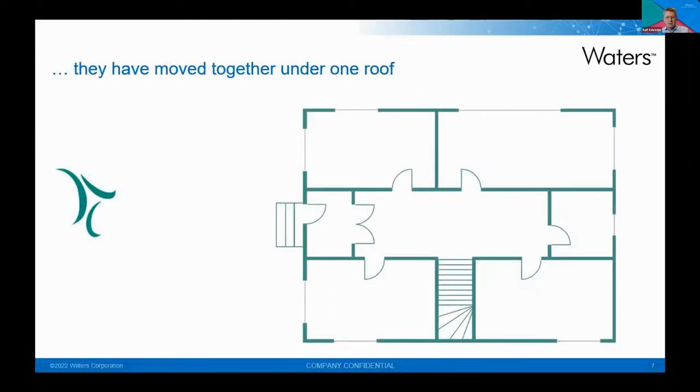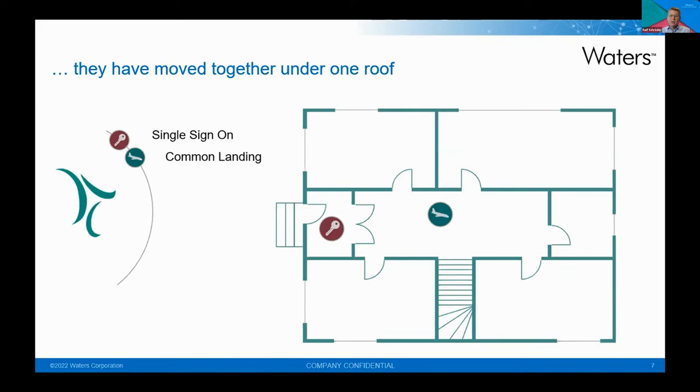So the two have really moved together under one roof, where all the features of a closely integrated solution are applicable. And to mention is that you will land on a landing page with a single sign-on. So you just take your credentials, type it in, and you have access to both the features of Empower and the features of the Genesis application.